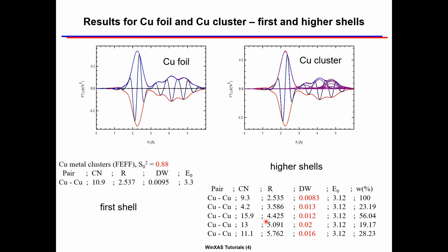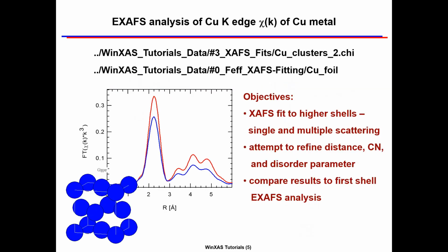Hence, the resulting coordination number should be larger. Apparently, this is not the ideal approach, and we may want to look for alternatives. Experimenting with possible alternatives is the subject of the hands-on session which comes next.